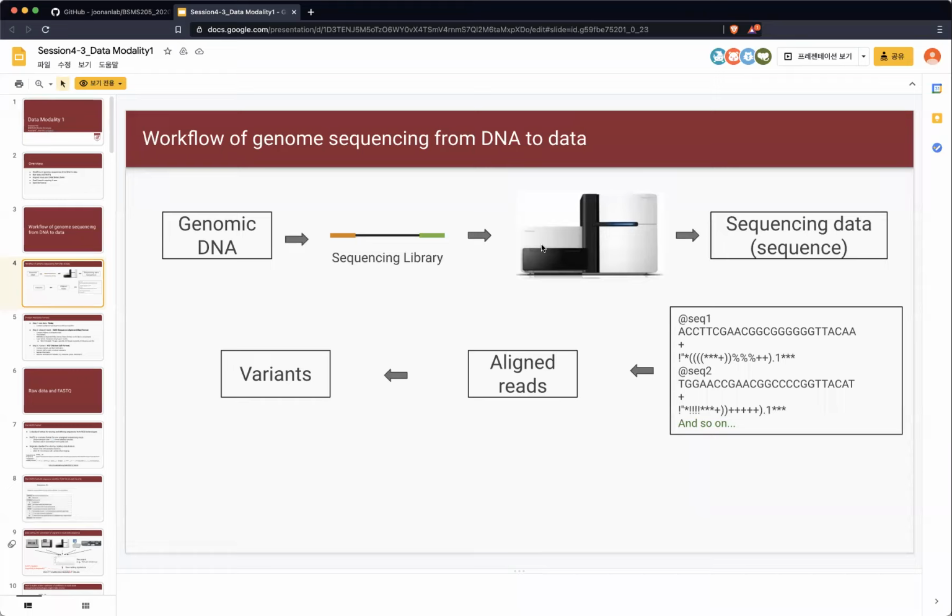So we can say you prepare the library, or use the abbreviation, you prep the library, then put it into the machine, right? I can guess that in your career you will work with either an Illumina machine, PacBio, or nanopore. I normally say you put the library into the Illumina machine.